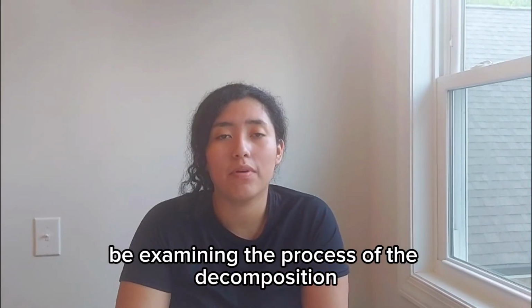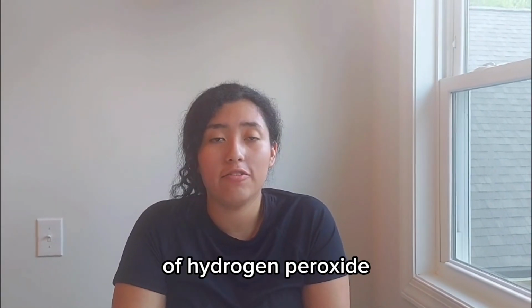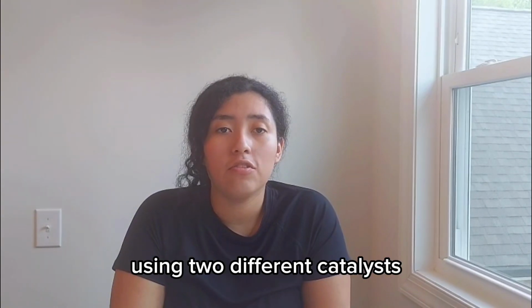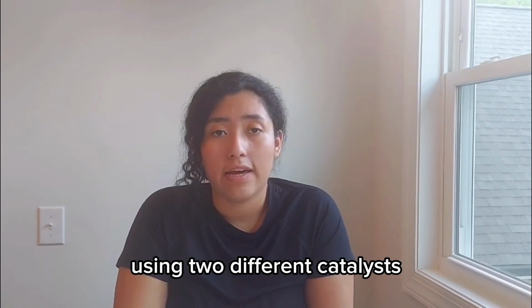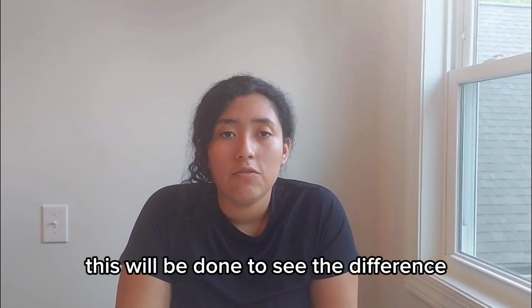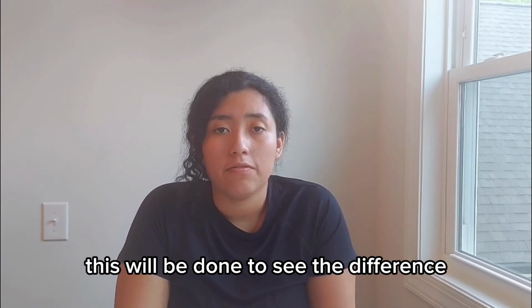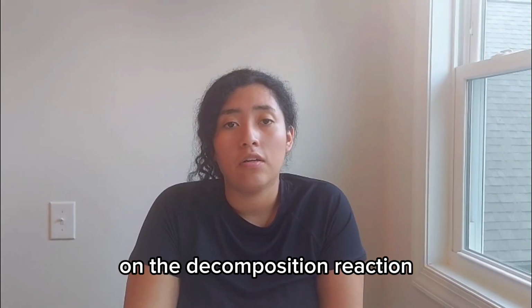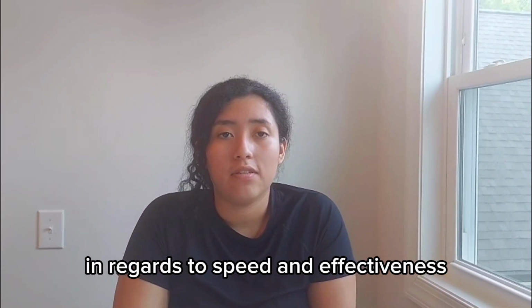We're going to be examining the process of the decomposition of hydrogen peroxide. The goal of this experiment is to compare the initial rates of the reaction using two different catalysts. This will be done to see the difference in how much effect the catalyst has on the decomposition reaction in regards to speed and effectiveness.